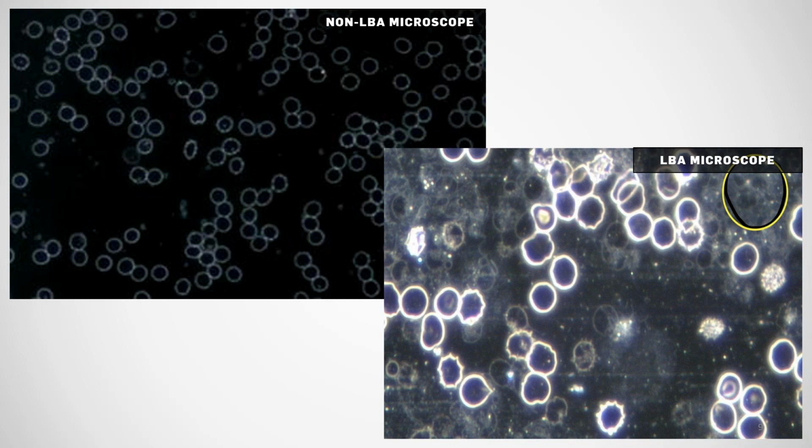So really not practical to use in a live blood environment where you have movement going on the screen all the time. What often happens then is that you end up having to adjust the resolution on the camera to a much lower resolution so that you actually get a smooth video with a high enough frame rate.